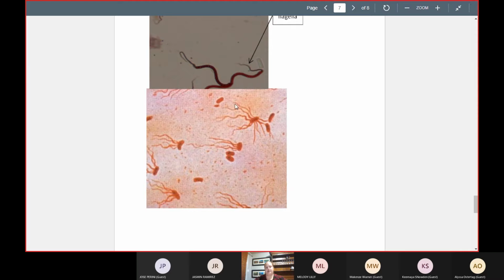And this top bacteria here has tumbled, what's called tumbling. So bacteria either swim or tumble, and when they tumble, they spread out all of their flagella, and then they choose a random direction, and they'll start swimming in that random direction.